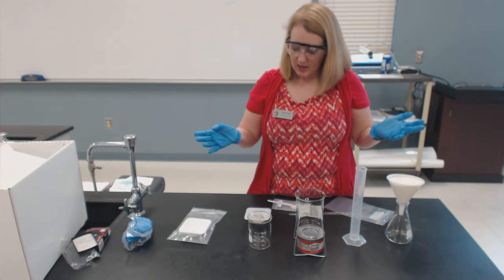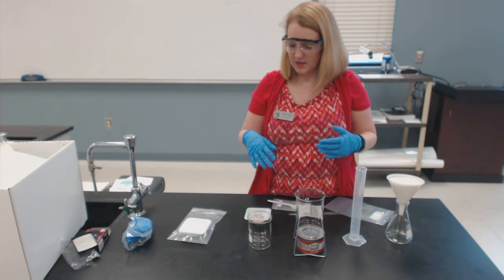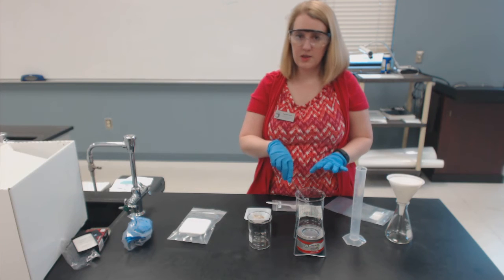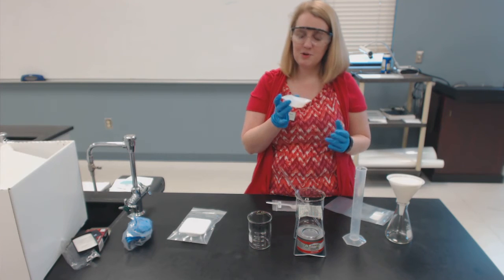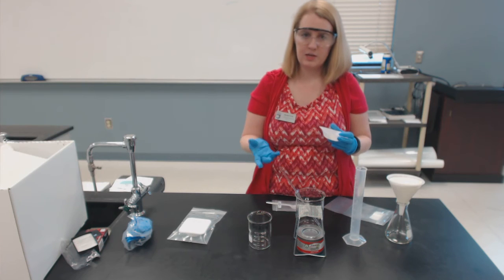So make sure, again, you wear safety glasses, safety gloves, safety first. If you end up using the stirring rod, all that kind of stuff. Now, ammonium chloride, I did say it sublimates. That means it goes directly into gas phase. So that vapor, it's not very harmful, but it's not the kind of thing I would breathe deeply in.